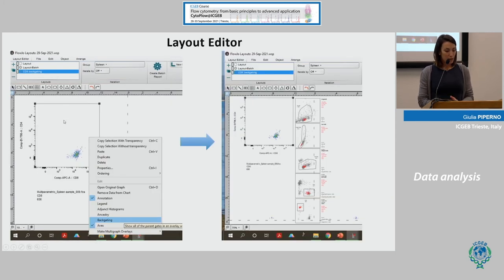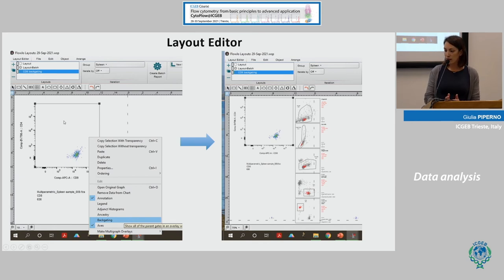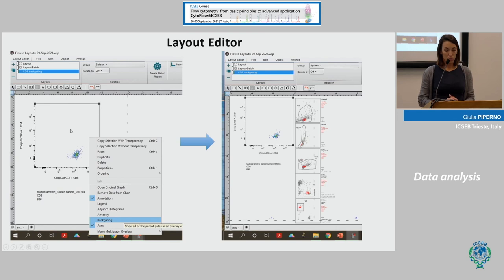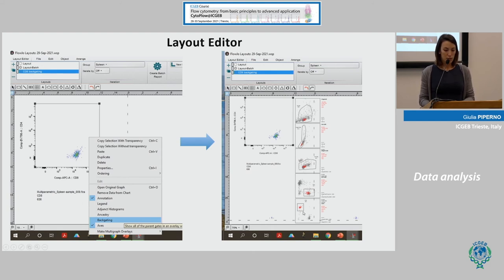Using Layout Editor, we can also perform backgating. For example, if we are interested in CD8 cells and want to know where they are located in our gating strategy — to confirm we captured all the cells — right-click and select Backgating. The CD8 cells appear as red dots located within the CD3 cells that are alive and single in the original gates for the physical parameters.